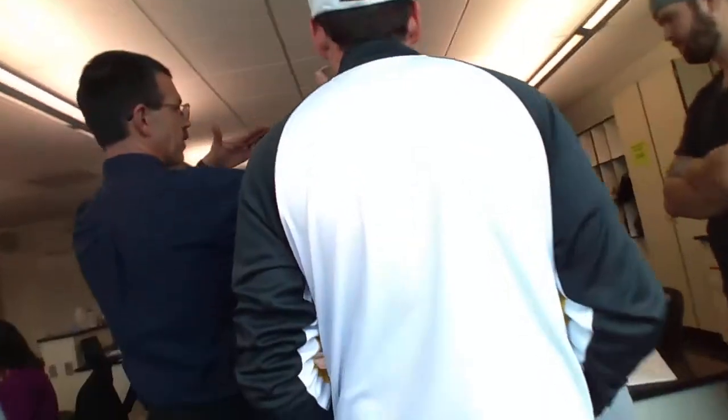Use your mouse and find the points. So, why did you adjust the baseline? Make it flat. Sometimes they'll be like this. Christie adjusted the baseline to make it flat. Is that narration? Yeah, so I'm narrating for you guys. You're welcome. Everybody here thinks I'm a creep, and you're going to be really grateful for this video. You owe me your souls. All right, and $50.